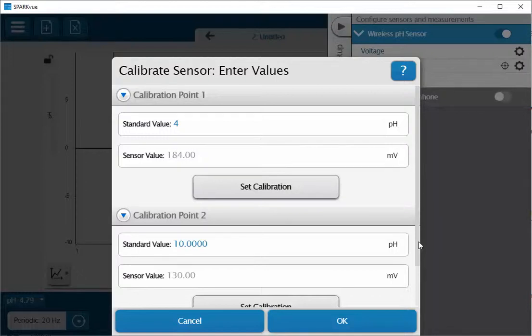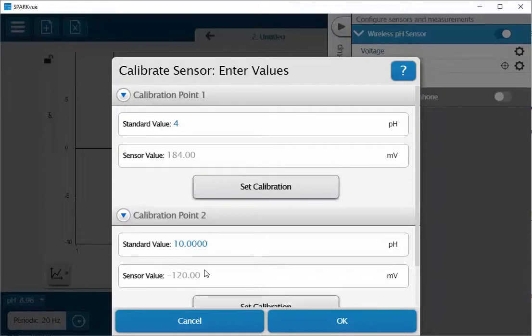Now going to immerse my electrode into the second solution. In this case it's a pH 10 solution. Dunk that in there and wait for a moment here and wait for it to stabilize.